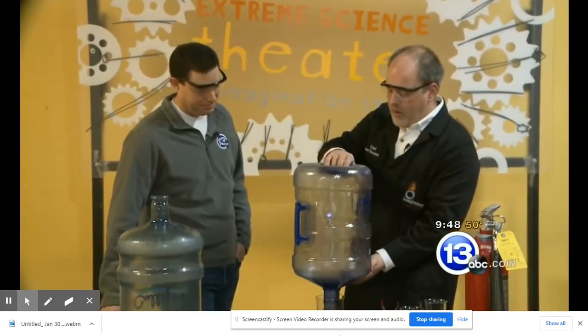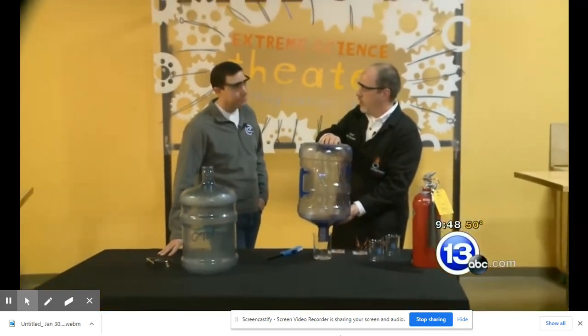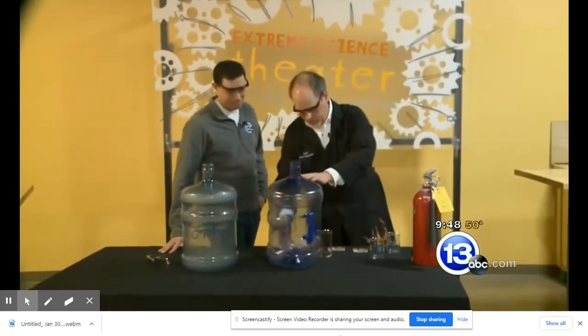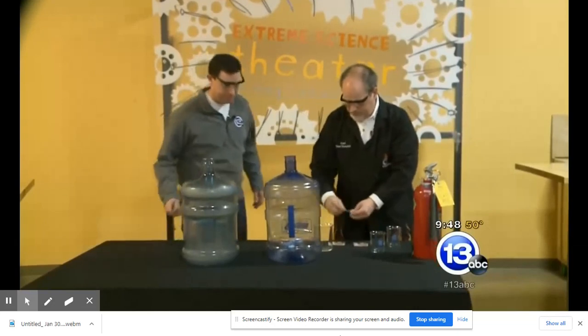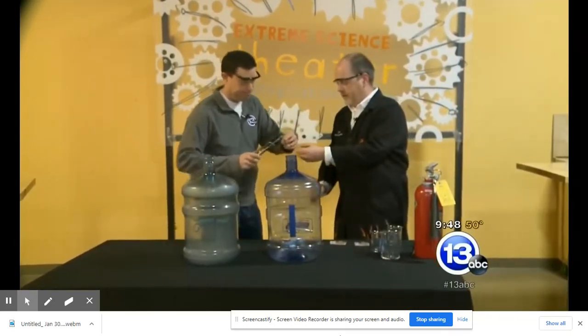Now, the question is, what would happen if you could contain those gases inside the jug while they cool? Okay, so we're going to do the same thing again. Jay, I'm going to let you go ahead and grab your tongs. We'll do the same deal. And this time we'll add a little twist at the end. So I'll let you go ahead and put your matches in there.